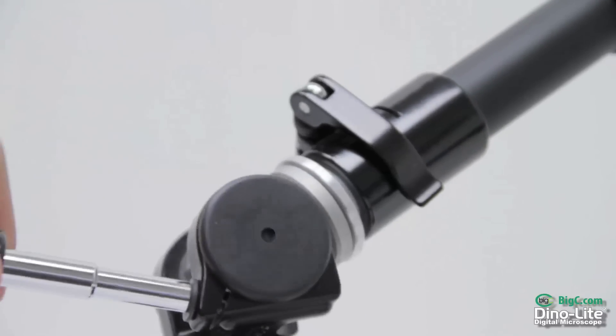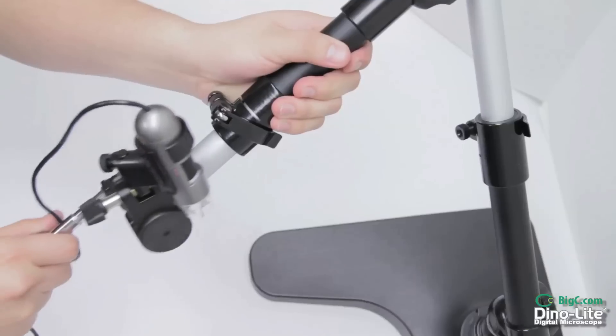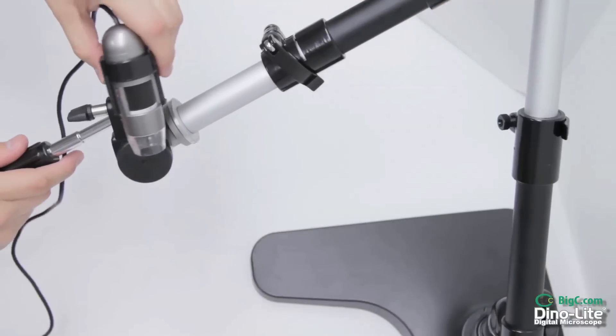The MS-52B is made from recycled aluminum, providing a durable and lightweight stand. This stand comes in at 4 pounds.